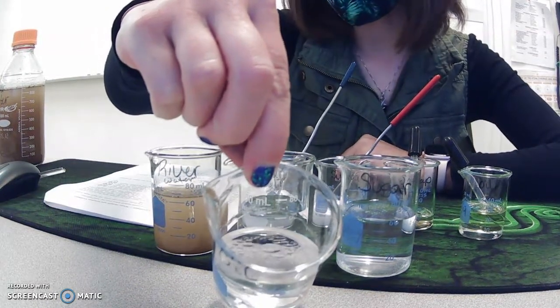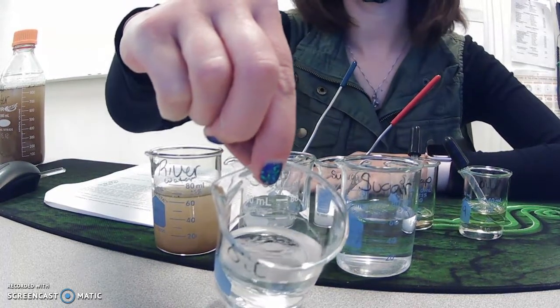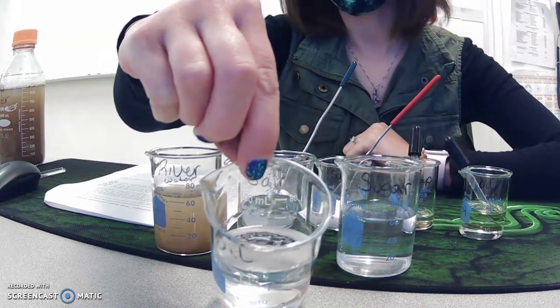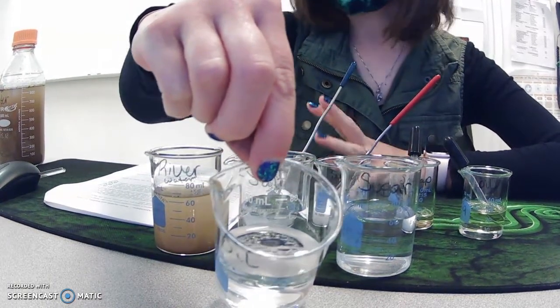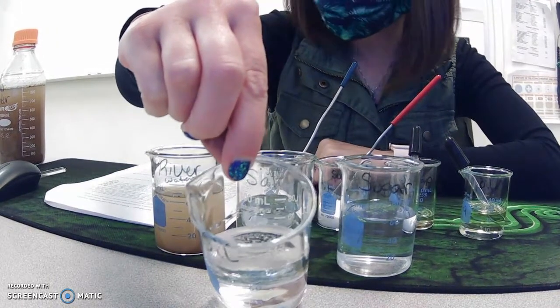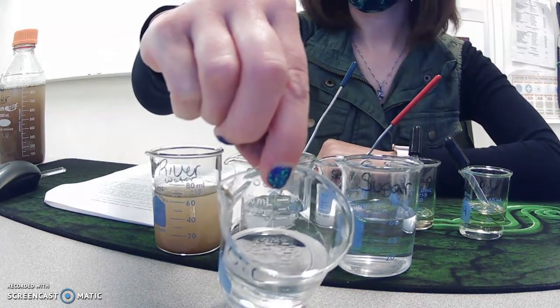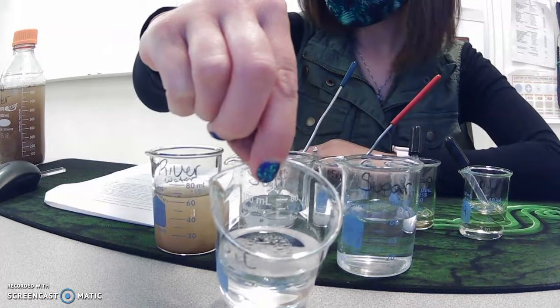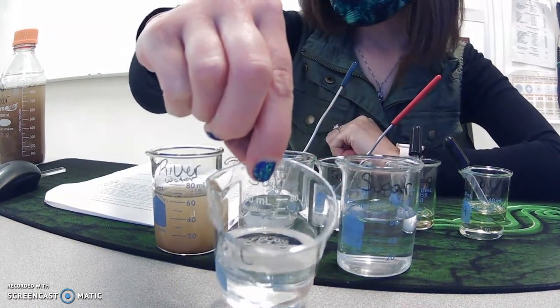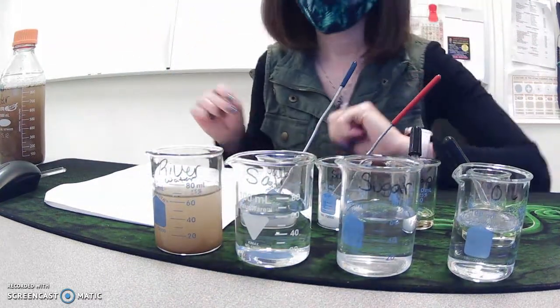So describe what you see. What can you see in the water right now? How can you tell that this is a non-polar molecule? And remember, water is a polar molecule with a partial positive and a partial negative. We use the glass stirring rod. What happens when we stir it? What appears now? Is the oil mixed in? Is it not mixed in? Is the oil visible? What do you see? And we'll kind of set this aside and then see if anything else happens or changes.